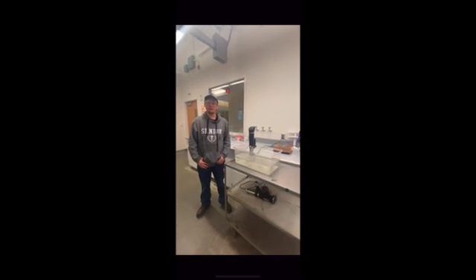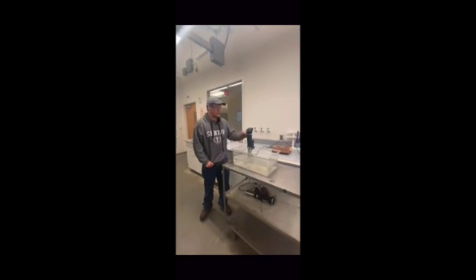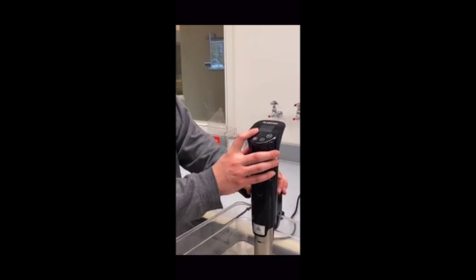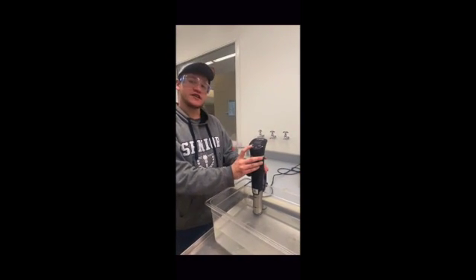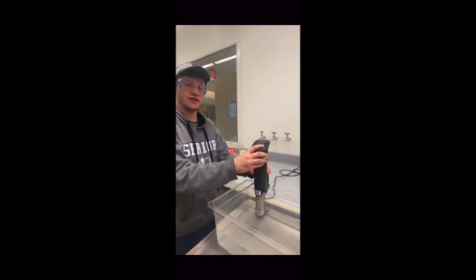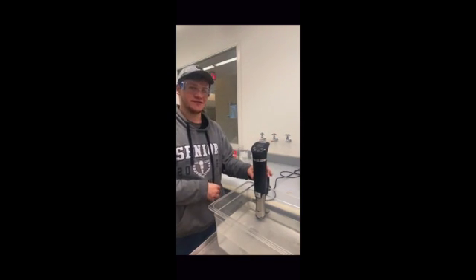I'm Ashton Downley, and I'm going to be going over some of the equipment we used as well as how data was collected. I'll start off with our Karstein heating module. The first thing you're going to want to do is turn it on. Then you'll direct it to the temperature that's desired. In our case, it was 32 degrees Celsius, by using these up and down buttons, and then you'll hit set. And it will heat up until it's ready, in which case it will beep every 5 seconds.